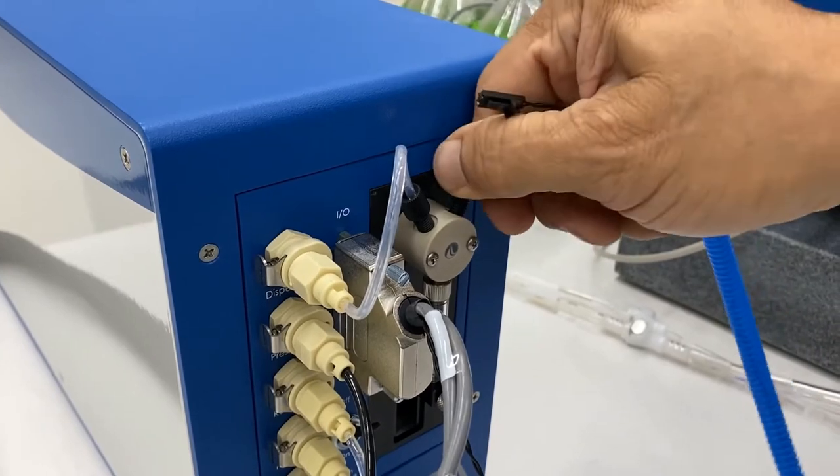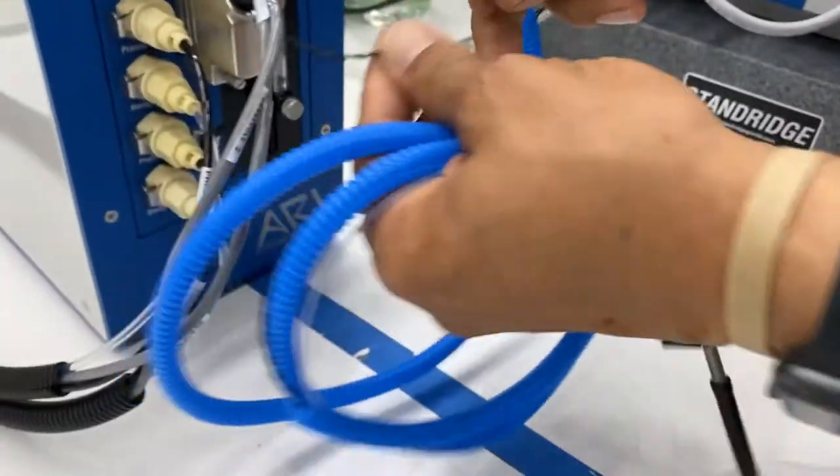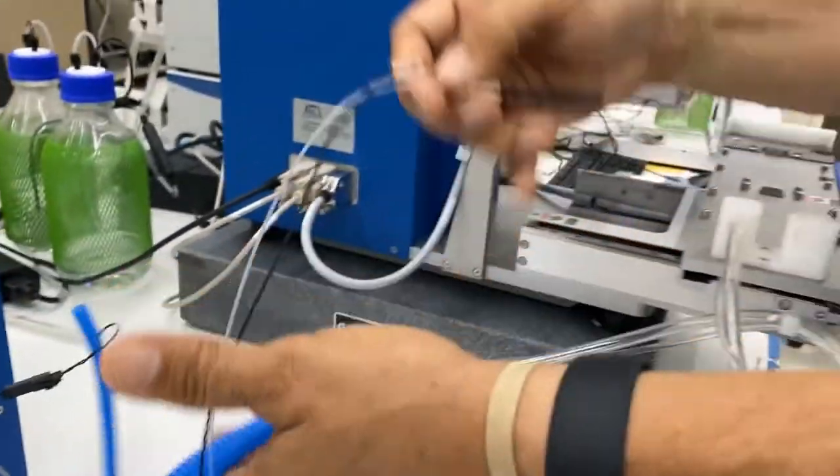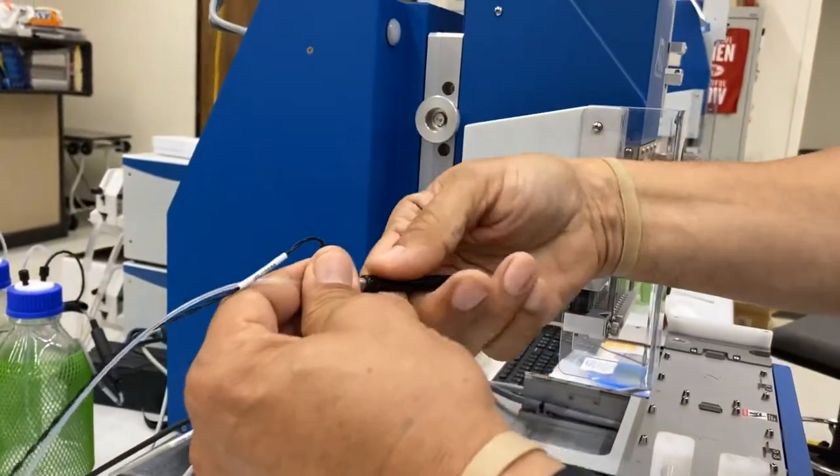Firmly tighten. Clip on the communication cable. Remove the protective cap from the nozzle.